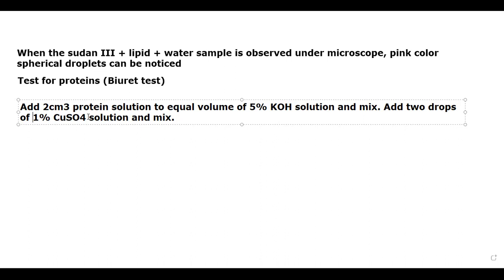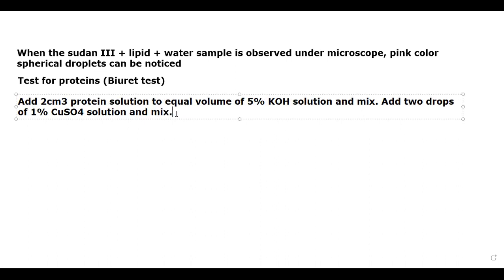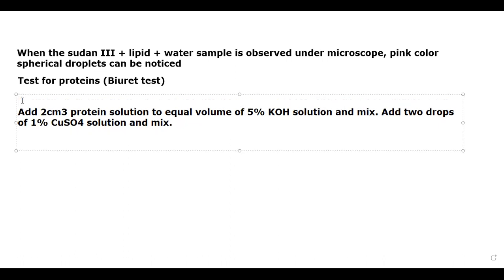Clear, sir. Similarly, copper sulfate solution, you need only 1%, 1 gram copper sulfate dissolved in 100 gram. Then for 10 gram it means 0.1 gram. Little only you need. No need to waste. Chemicals are very expensive. We have to handle them very carefully and economically.